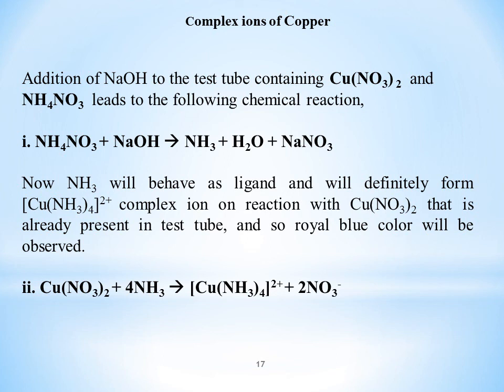So what is the role of sodium hydroxide here? You will report that sodium hydroxide first reacts with ammonium nitrate, and as a result ammonia forms, which can behave as a ligand.